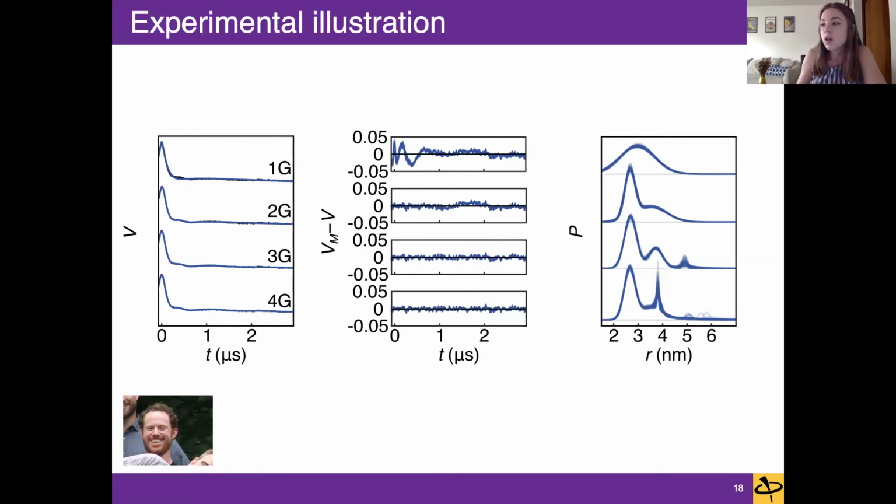So this is experimental data collected by a postdoc in our lab, Eric Evans, to measure the inter-subunit distance of a gated ion channel. And so we analyzed this DEER trace with anywhere from 1 to 4 Gaussians. Beginning with the first Gaussian, we see quite obvious deviation among these residuals, which is interesting because the distributions that are output are quite certain for this single Gaussian case. But even from what we know about the system, we could eliminate this as an appropriate model choice, since this distribution is believed to be at least bimodal.